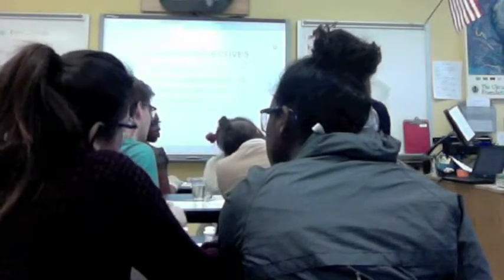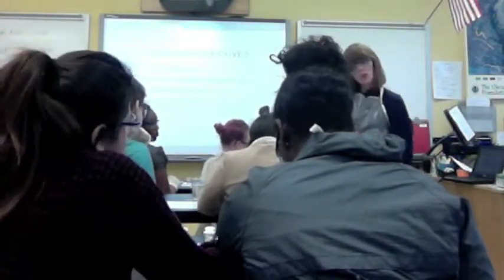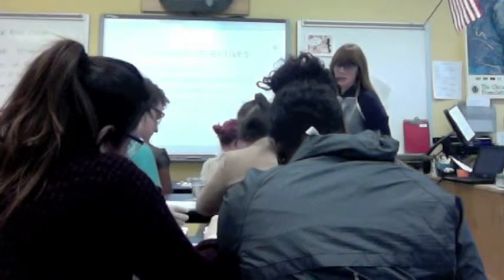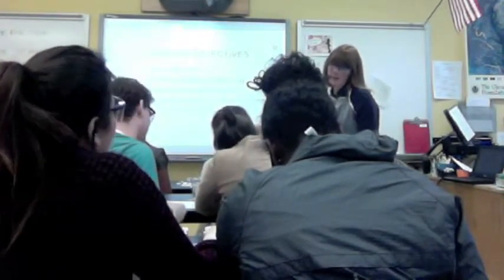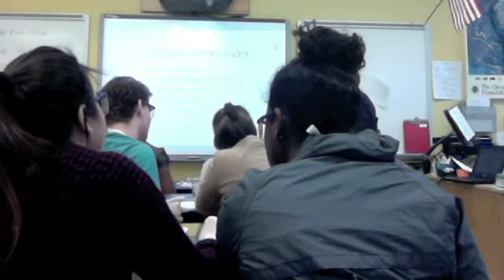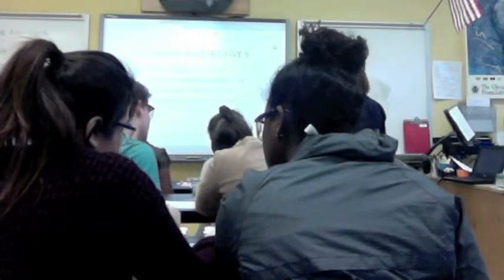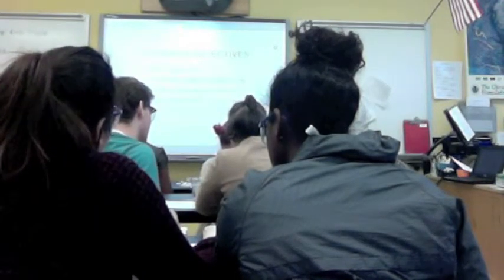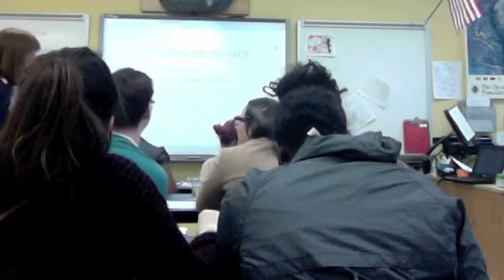All right, our learning objectives, just to recap. We were to conduct water quality testing. Did we do that? Yes. Did we learn to analyze the data collected? Yes, we compared it to these colors, and we talked about whether these are good levels or bad levels. And we understand the importance of water quality monitoring. Victoria, why is it important to monitor water quality? Because it's important for human health and for our environment. Absolutely correct. Does anyone else want to add reasons that water quality testing is important? Nailed it. Excellent.